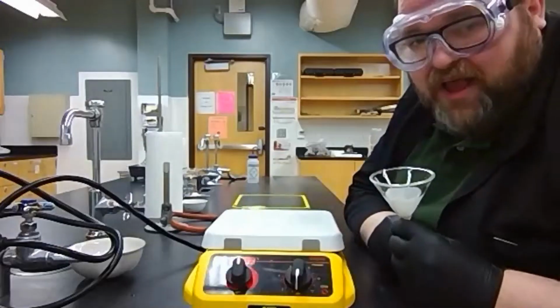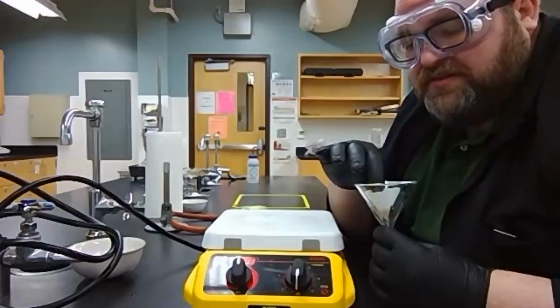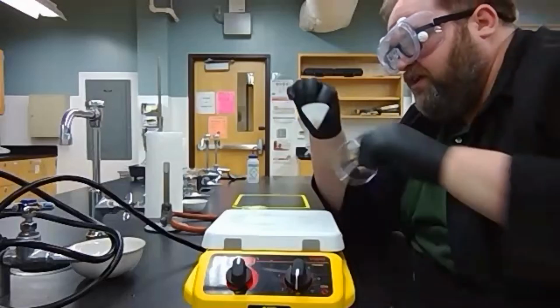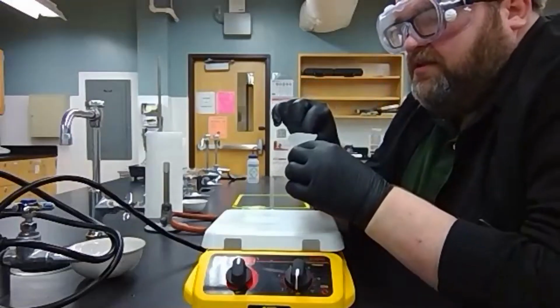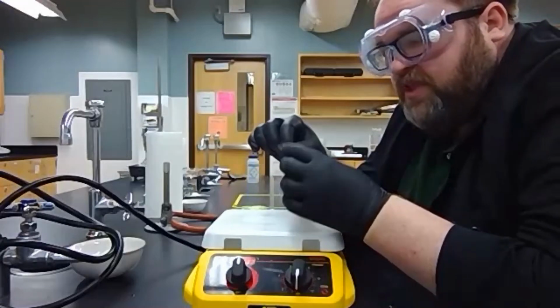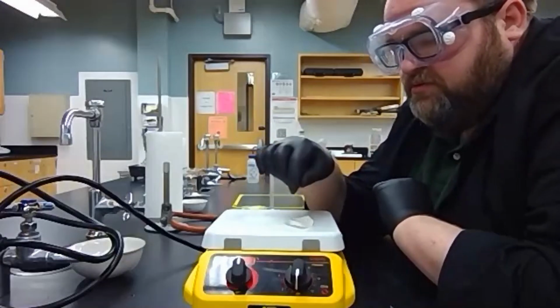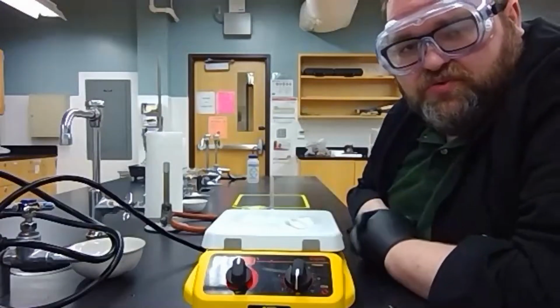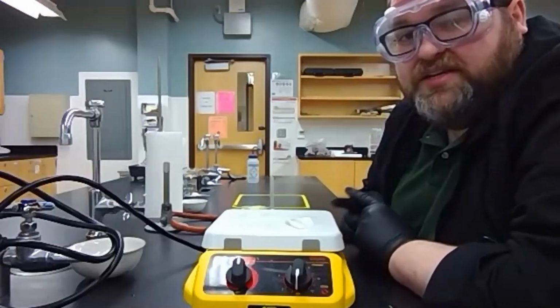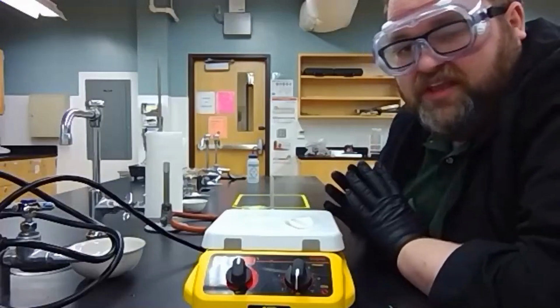Now, how do I actually do that? Well, you've got a nice little package here. You can just slide your packet of sand off of the funnel and then sort of fold it in half along those lines that you've already folded down. Now, this is ready to warm up. Put it just one side down directly onto the hot plate. This is going to take a minute because it is water and it does take time for water to dry. So just leave it sitting there.